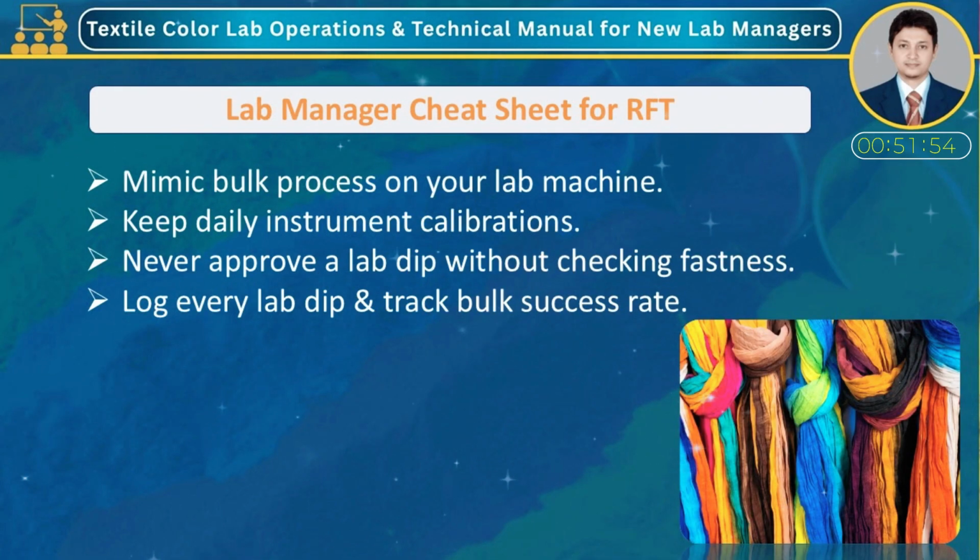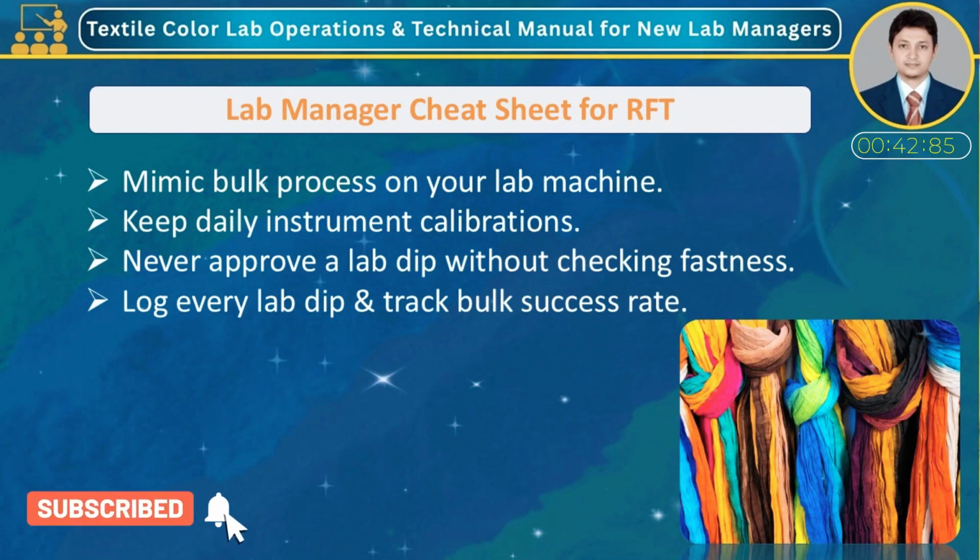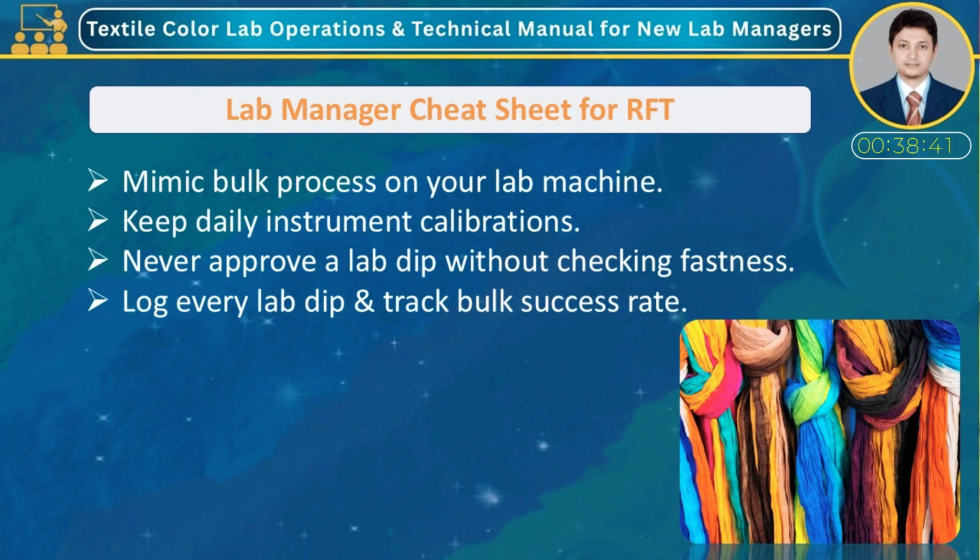Lab Manager Cheat Sheet for RFT. This cheat sheet highlights the daily habits of high-performing labs. Always mimic bulk conditions, keep instruments calibrated, verify fastness before approval, and track lab-to-bulk performance. These simple practices create a strong RFT culture across lab and production.